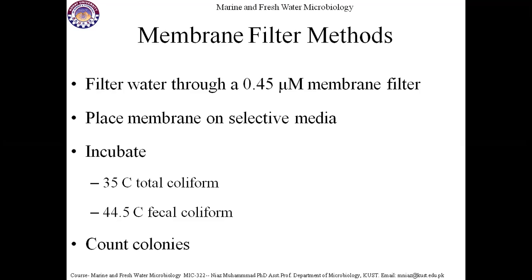And after 24 hours or 36 hours, we can count the colonies, to see how much coliform is present in a reasonable size of water which has been filtered through the membrane. So this is called the membrane filter method.